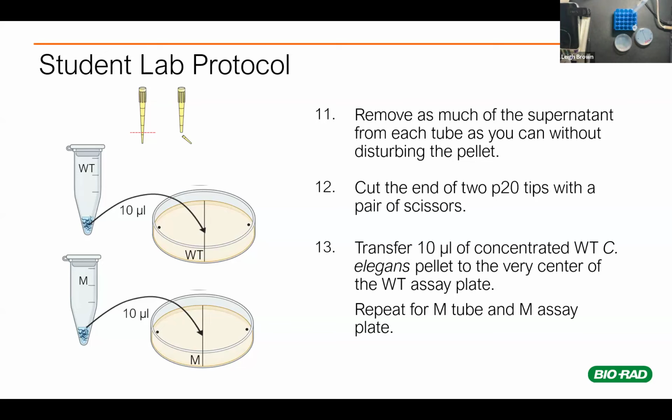One thing to also think about with this lab is that your experience is kind of the final activity or the final lab that the students are doing. They are actually working with these worms previous to this. They're doing the subculturing of them, which Lee and Tamika did, and they're also setting up the plates the day before. So the students do get a lot of practice with the worms before moving to this assay stuff that we're doing right now.